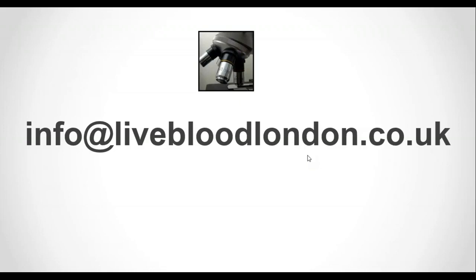Is a 3 watt LED system acceptable to learn this technique until I'm able to get a higher quality system like you recommend? Yes, absolutely. So you will be able to enroll and start the course with that microscope. But as I mentioned, with dark field, 3 watt LED won't really be suitable.